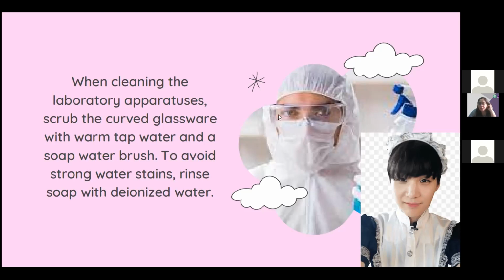Okay. And then, most of the time, we use soap when we wash them. Pero we really have to clean them thoroughly if we wash them with soap. Para walang maiwan na residue. And malalaman talaga natin yan pag may naiwan na residue. Kaya after drying, magputi-puti ang atuang glasswares. Okay?